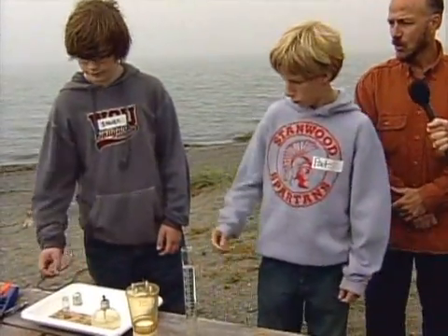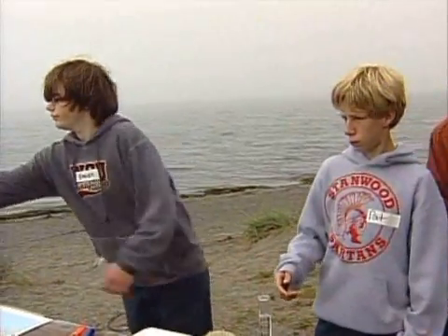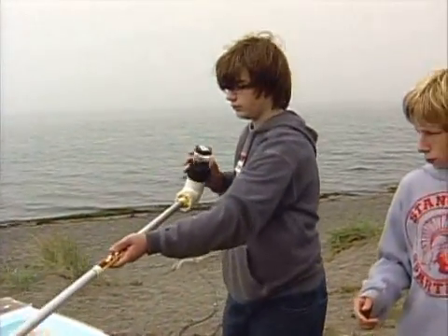Well, I'm going to need some help here. I need Pat and Steven. These guys are experienced fecal coliform testers. And what we did is we went out in the bay and we scooped, can you guys show them the scooper? We scooped samples in a jar where we could take about 250 milliliters of water.